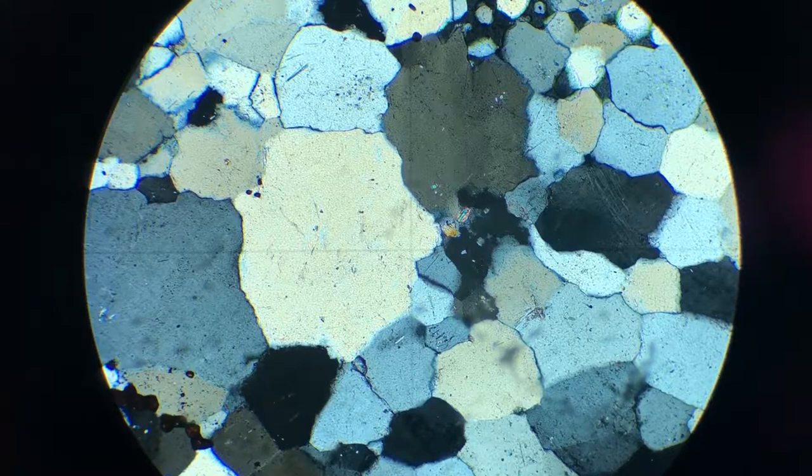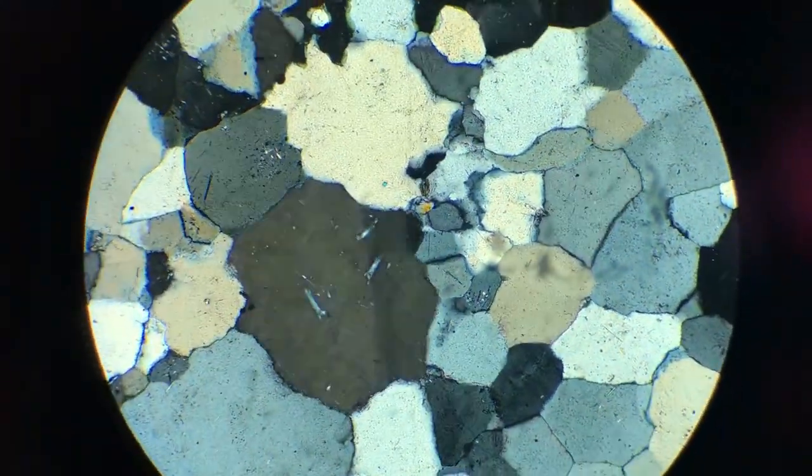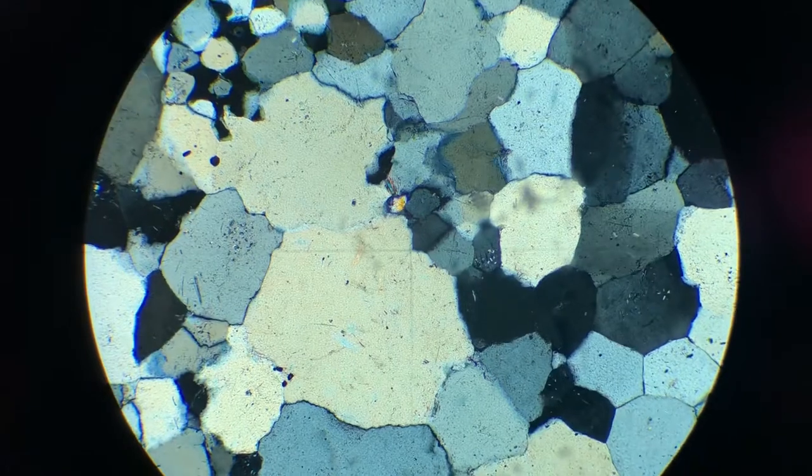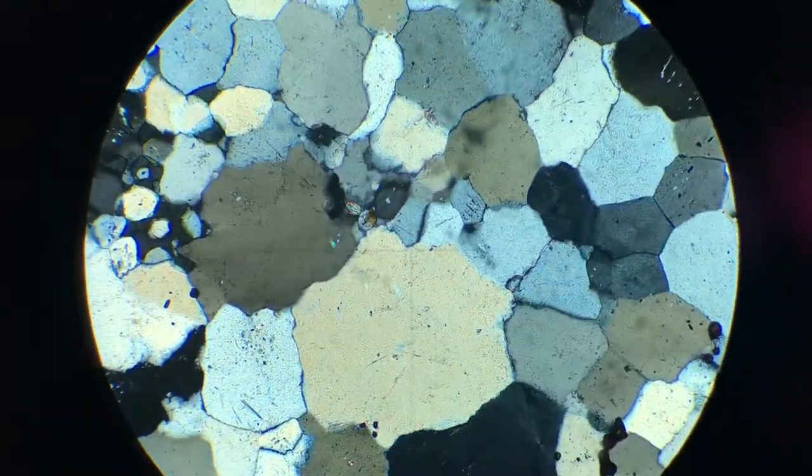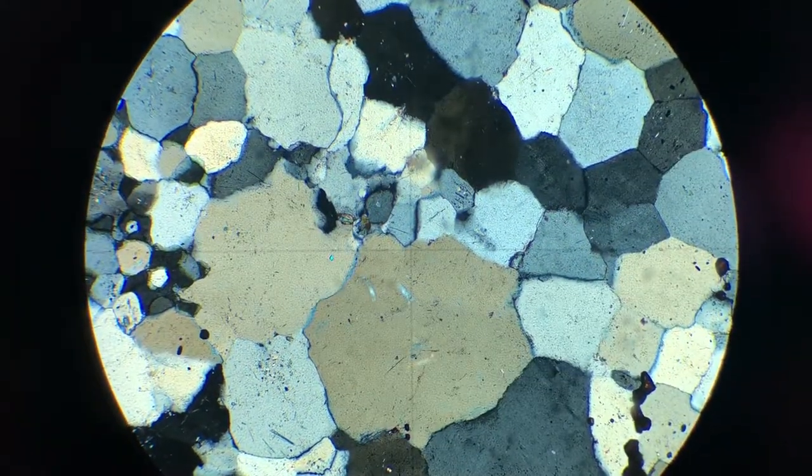This is a thin section that was not polished down enough, and therefore is a bit too thick. Instead of the expected light to dark gray interference colors, now the quartz is rather yellowish to brownish gray.